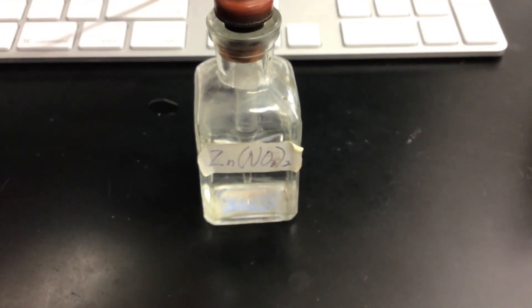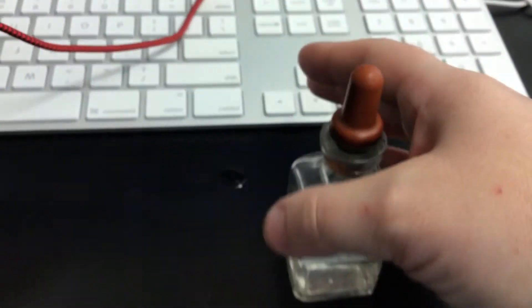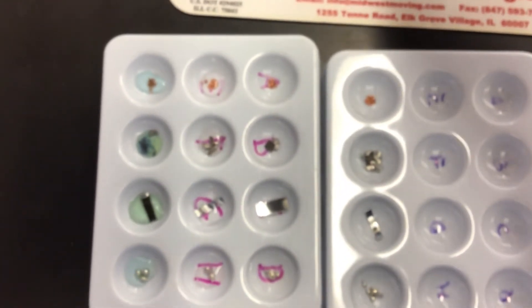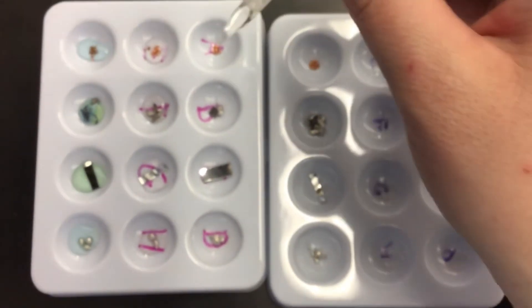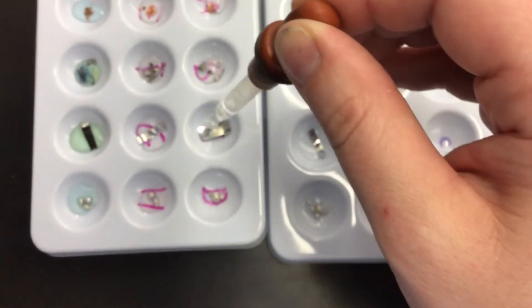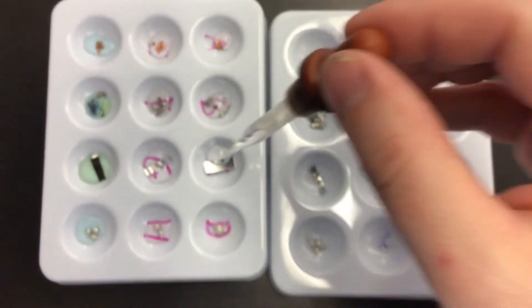Now we've got zinc nitrate. We're going to go ahead and put a couple drops of zinc nitrate with each of our metals.